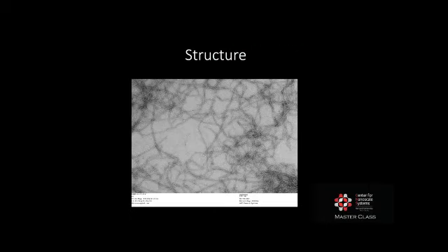So let's talk about structural data first. When you are preparing some sort of protein, either completely in a test tube or if you're purifying it from cells, when you've got this protein purified, you're going to want to take a look at it and see what it is, what it looks like, and how it's organized. So in this example, we have amyloid fibers that are relatively easy to make, but things can go wrong and things can become aggregated, things can be contaminated. So we want to get a quick look at these things by EM first.